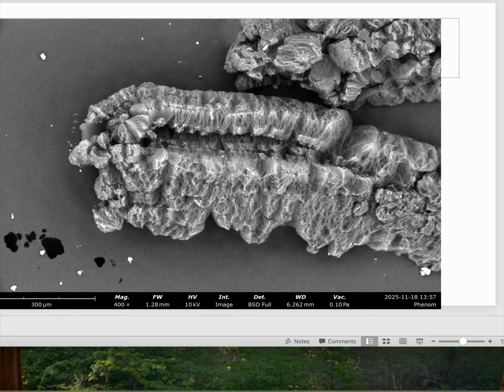So we'll be able to see this component in the composite and differentiate it from the other materials such as activated carbon, white halloysite clay, which is nanotubular, the CMC or Teflon binder, and some other materials that we'll be examining.